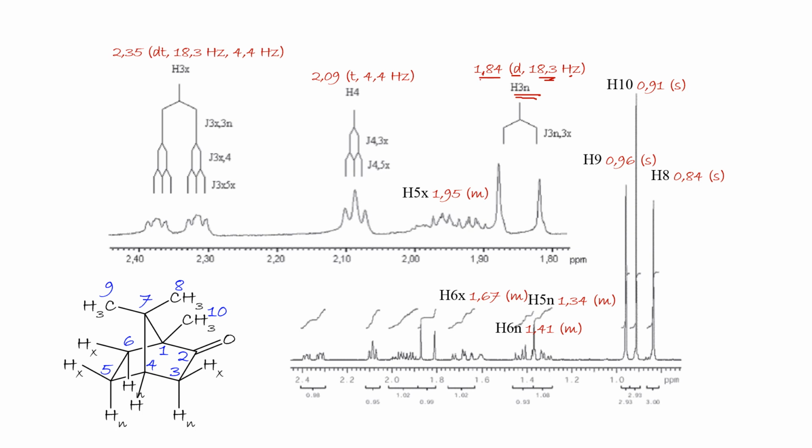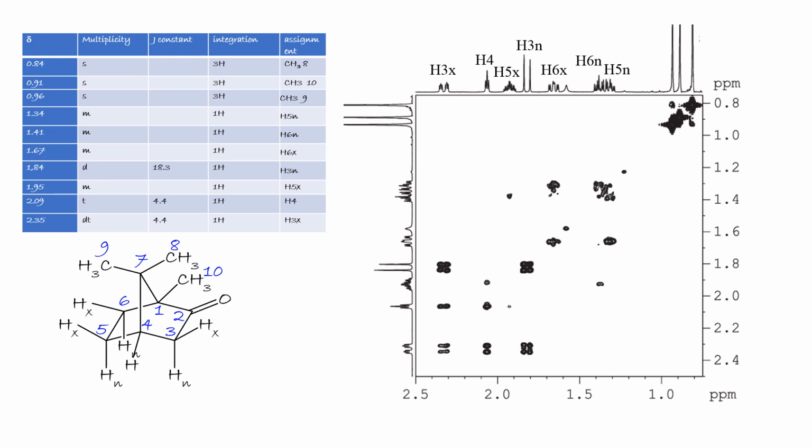Once I knew the position of H3N, to assign all proton peaks, I used 1H-1H COSY. I know the H3N position for sure. Now, H3N should be coupled from the structure with H3X, yes.